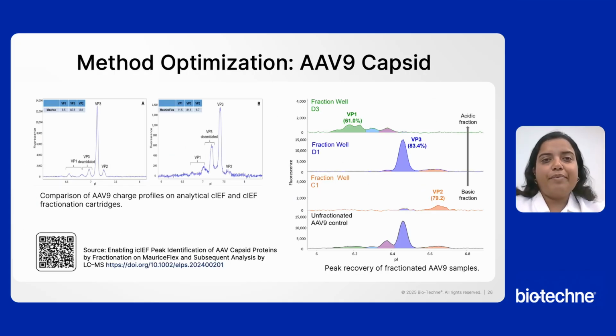Here's another example where fractionation on the MauriceFlex icIEF platform enabled isolation of charge-separated AAV capsid protein species VP1, VP2, and VP3 for downstream LCMS analysis.